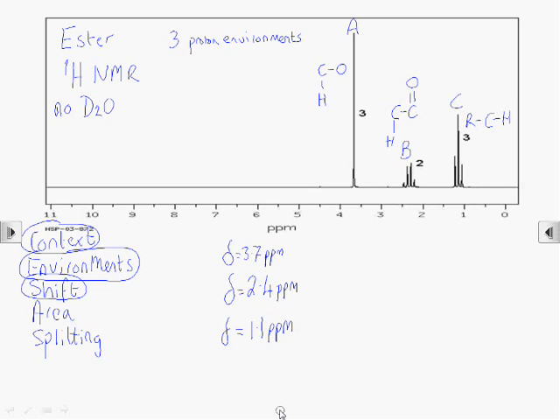Next we need to use the area information. This is the area under each peak, and it tells us how many protons are in that environment. So there are three identical hydrogens in environment A. That makes A a CH3 group next to an oxygen.